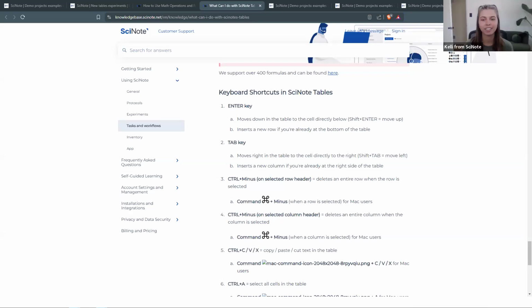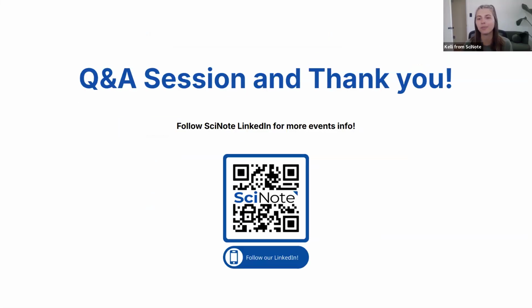Yes. All right. So I know we went through a lot of questions. I wanted to make sure that there weren't any other questions that anybody had. And we can give you guys some time to type things out as well, because I know sometimes when you try to type something really fast, you end up making all the mistakes.